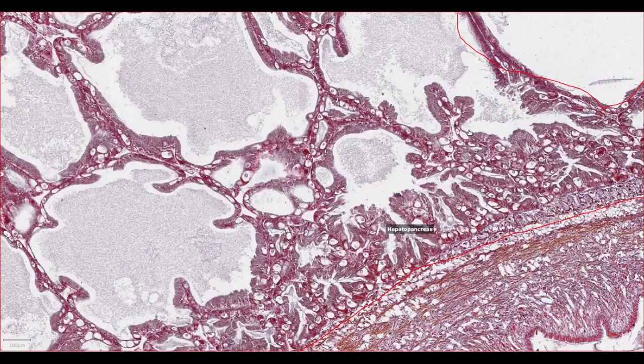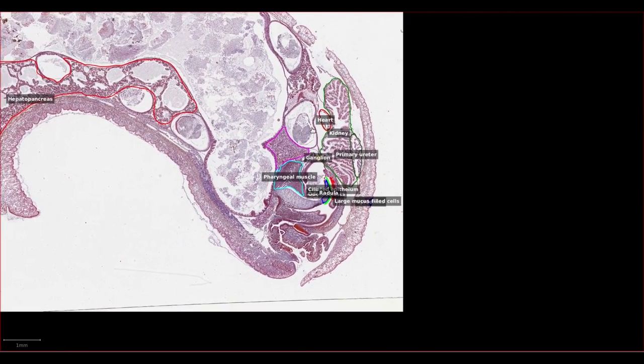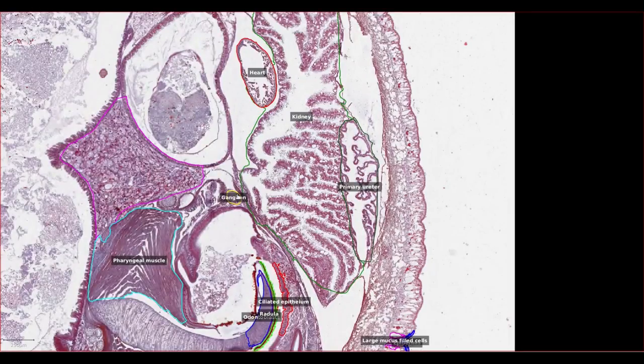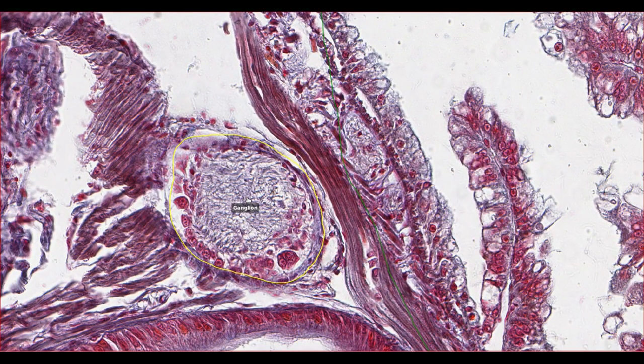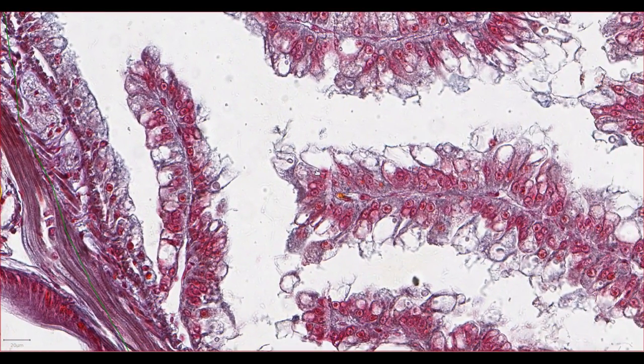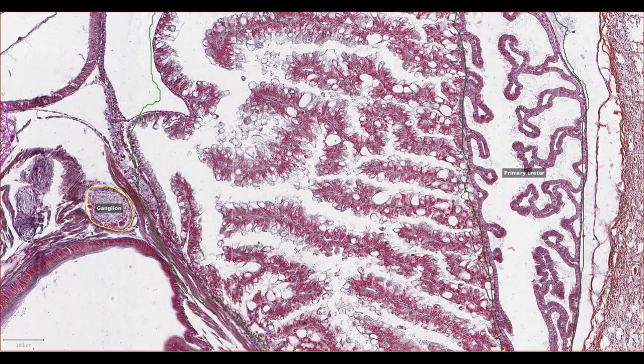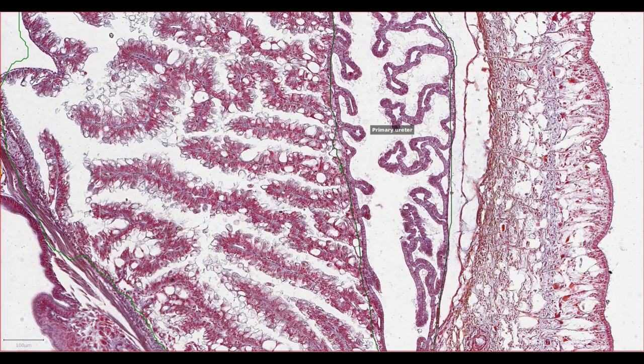All the other organs that we can see in this specimen are towards the head. There are some aggregates of neural tissue, such as this ganglion we can appreciate here, in which you can see lots of neuronal cells surrounding a rather emptier space of neuropil. Just adjacent to that, there's this large organ here occupying a good portion of the head. This is the snail's kidney, with a tubular structure just in front of it, which is the primary ureter.